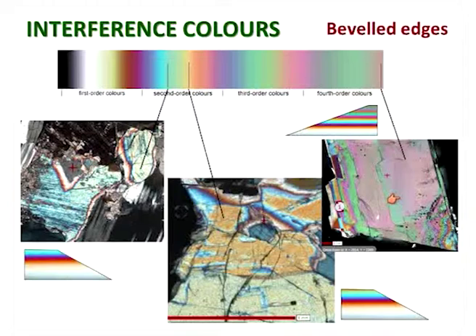So here I've just tried to show three examples. I can't even remember what minerals these are. I think pyroxene on the left, I think this is an olivine in the middle, and then this is a slice of gypsum.